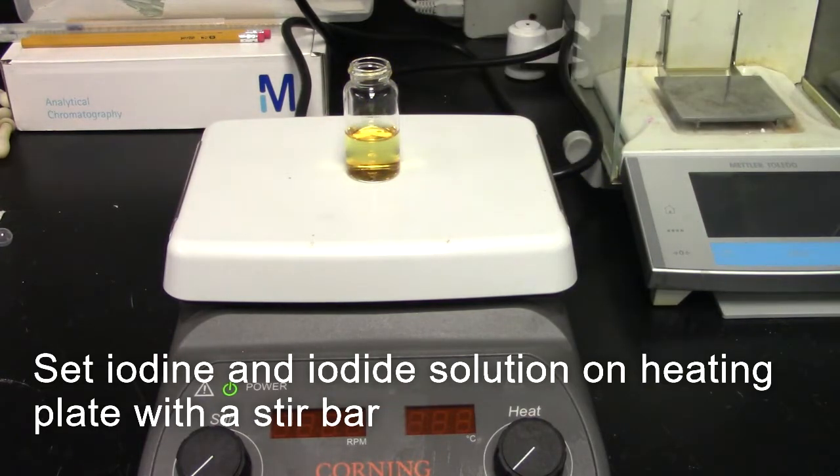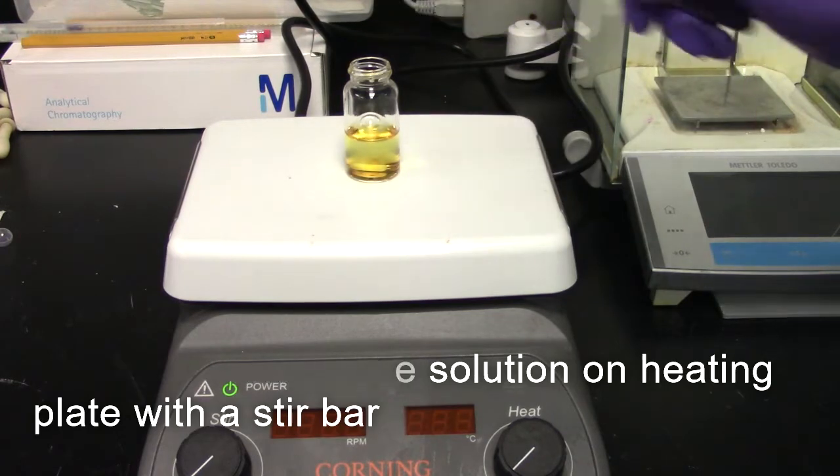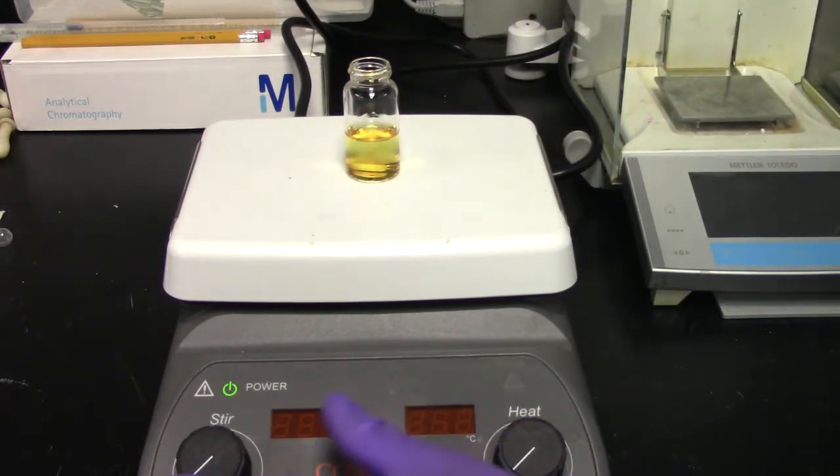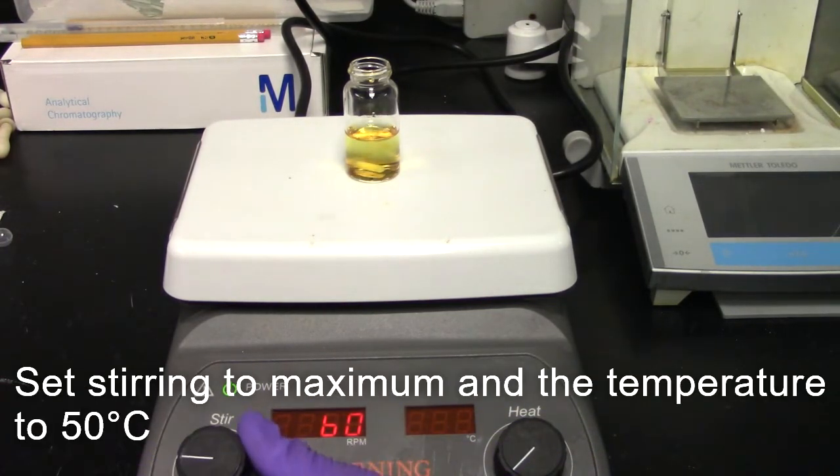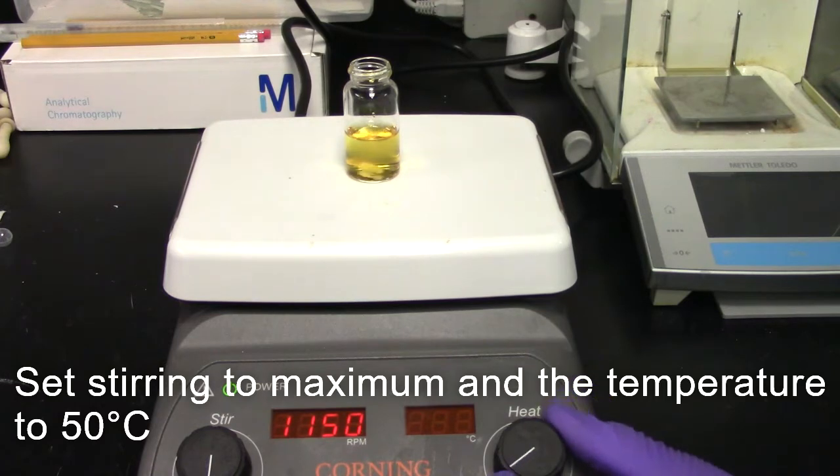Set the iodine and iodide solution on a heating plate and place a stir bar into the vial. Set the stirring setting to maximum and a temperature of 50 degrees centigrade. Carefully warm and stir the mixture.